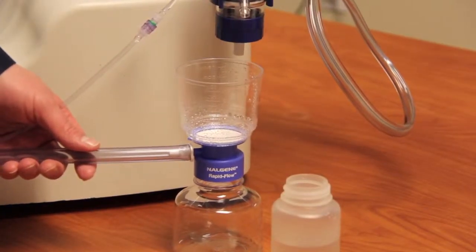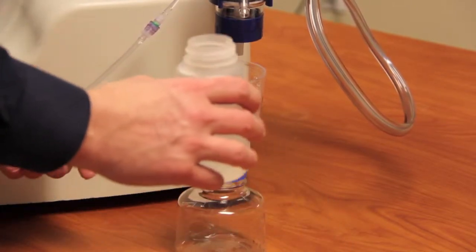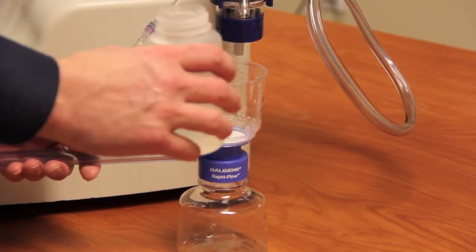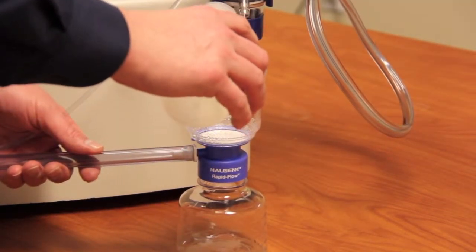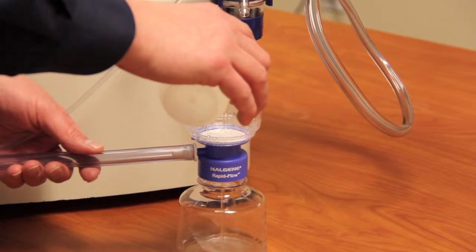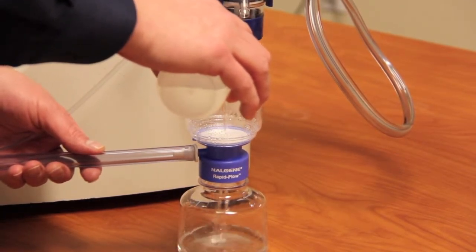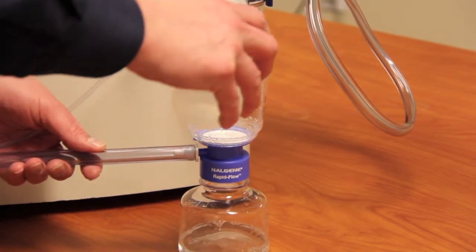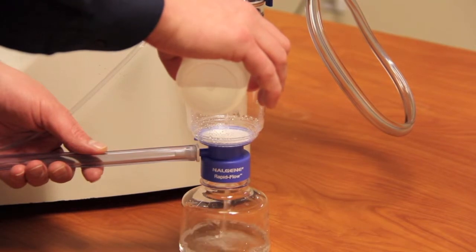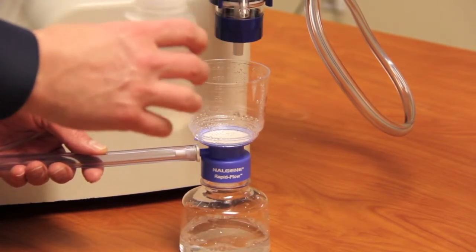So once you've turned the vacuum pump on and you've wet the filter, you take your sample, swirl it around a bit to make sure and suspend all the DNA material in that liquid, and then slowly pour it into the center of the filter. And if it's a clean sample, it should filter right through. Swirl it a little bit more, pour, swirl a little more.